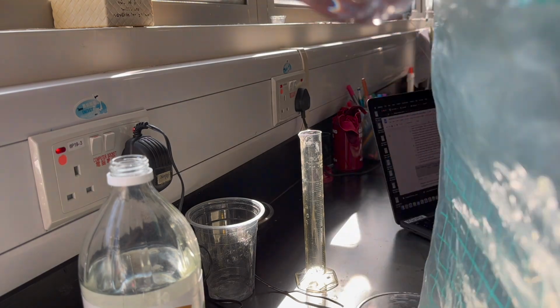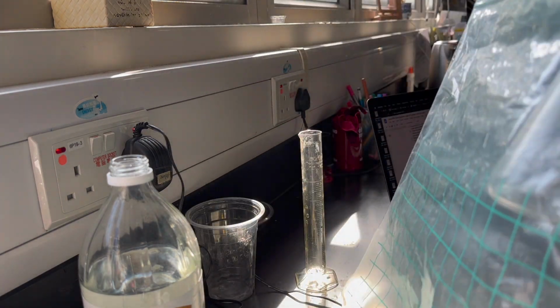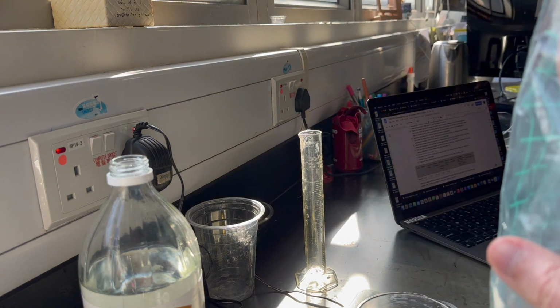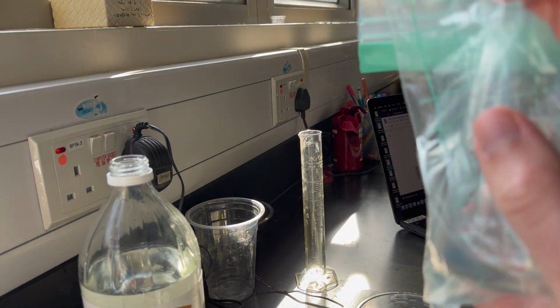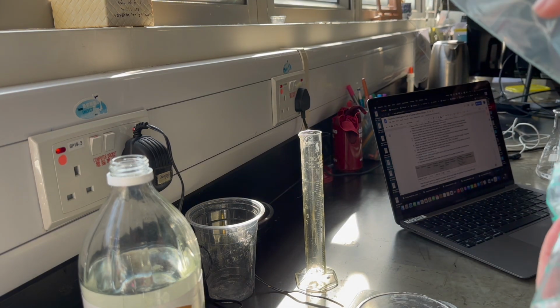So the gas that's released from this reaction is carbon dioxide. And carbon dioxide actually passes through balloon latex molecules fairly easily. So it's good to have this extra bag to contain any gas molecules that may escape through the latex.